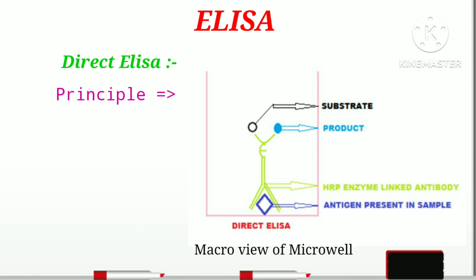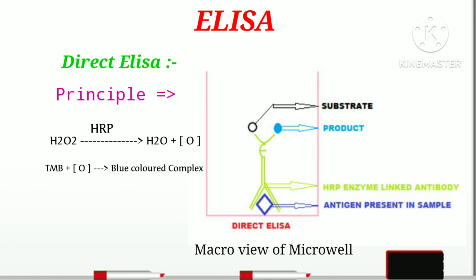The amount of bound peroxidase is proportional to the concentration of antigen present in the sample. After addition of the substrate, a blue color develops. The intensity of the color is proportional to the concentration of the antigen in the sample. To limit the enzyme substrate reaction, stop solution is added and a yellow color develops, which is read spectrophotometrically by the ELISA reader.